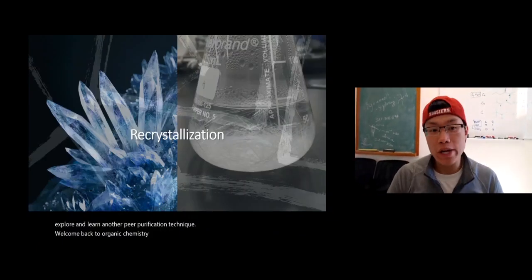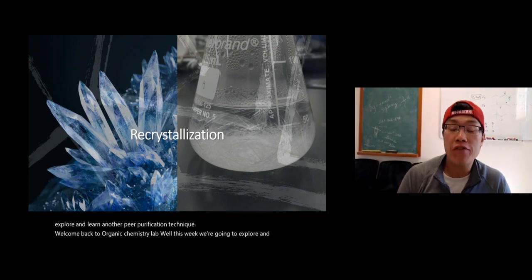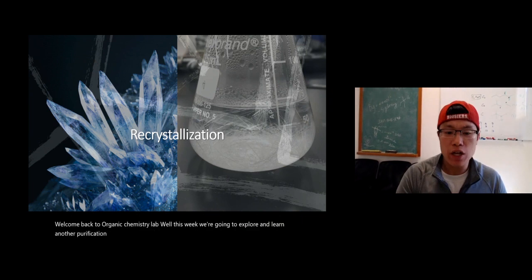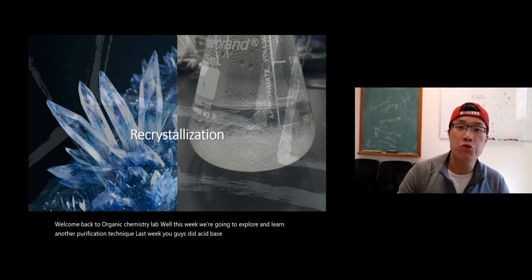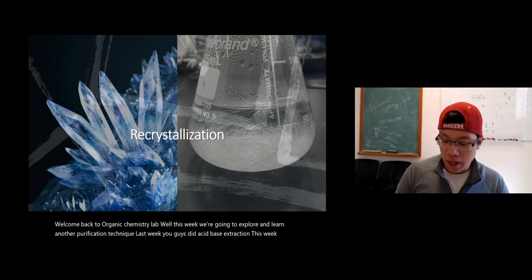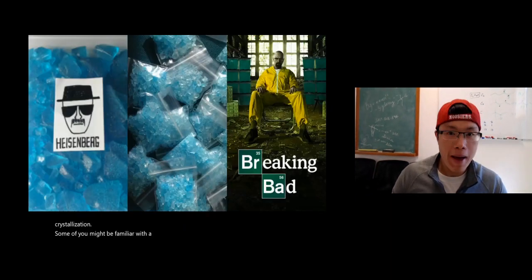Well, this week we're going to explore and learn another purification technique. And last week you guys did acid-base extraction. This week, recrystallization.